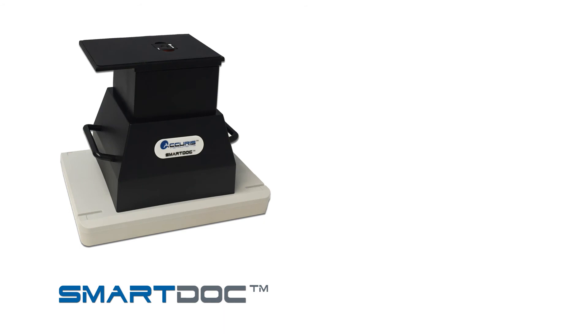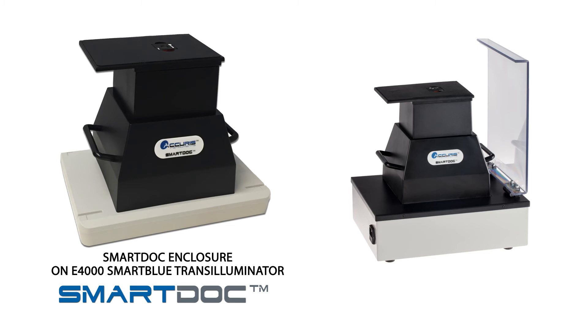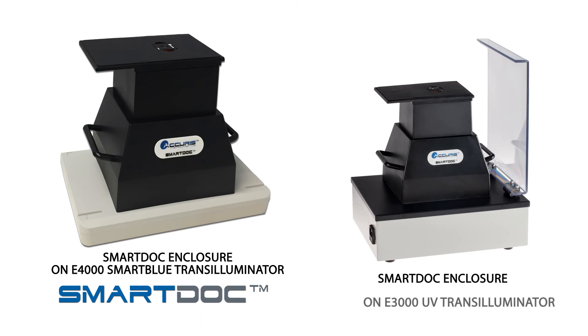Note that the SmartDoc imaging enclosure can also be placed onto a standard blue light transilluminator, such as the Acura Smart Blue. And if you stain your gels with ethidium bromide, it can be used with a UV transilluminator, such as the Acura E3000.